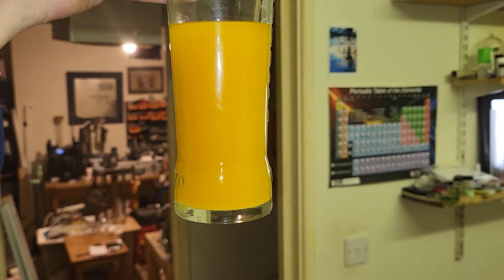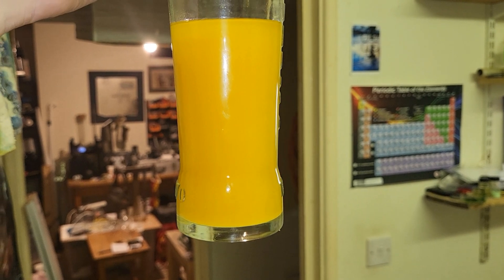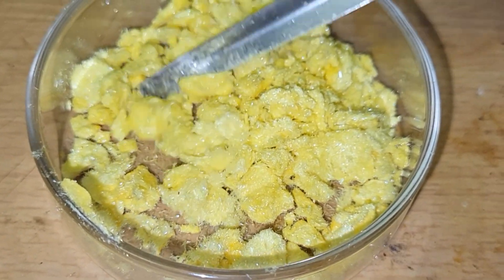That's the rest of it. Very fluffy crystals.